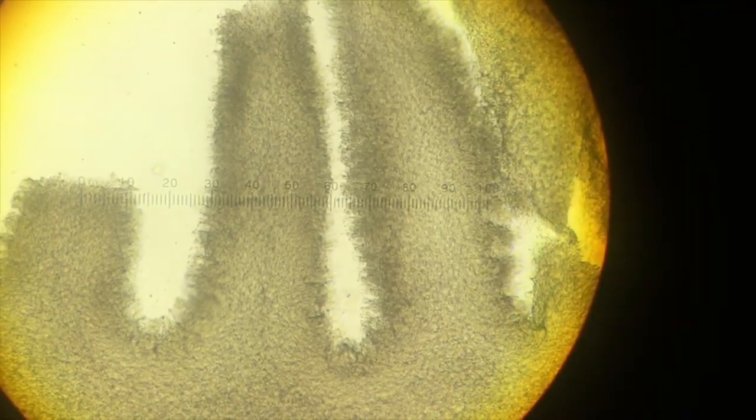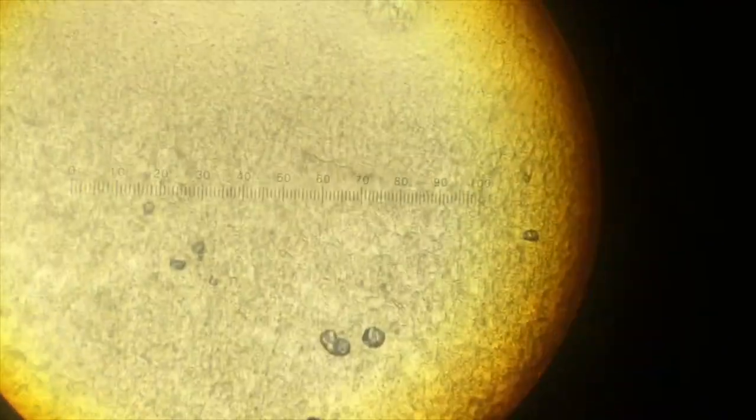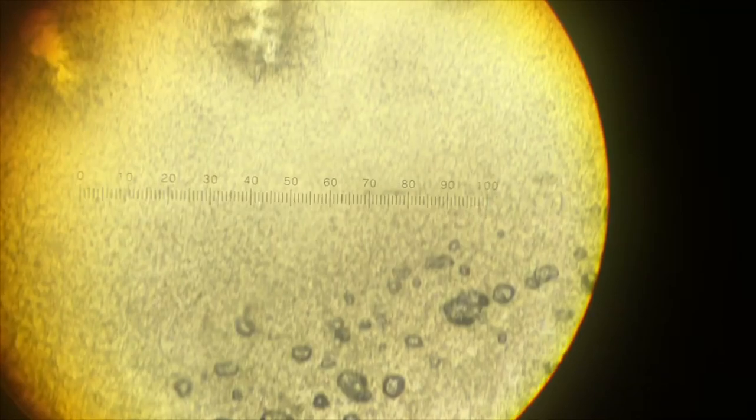But here, yep. This is basically correctly cut off. And then to show you an example of not correctly cut off, these are all showing the wrong surface. And so this section was completely useless. And this one really had just a few usable areas.